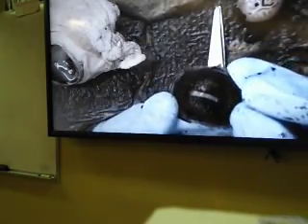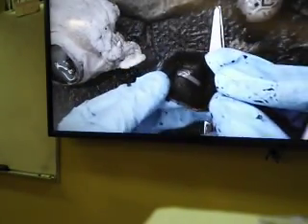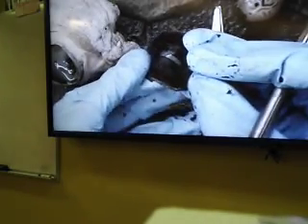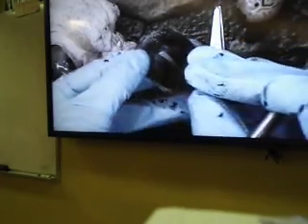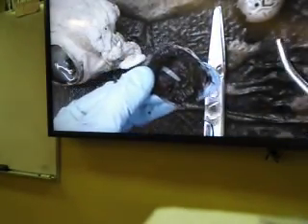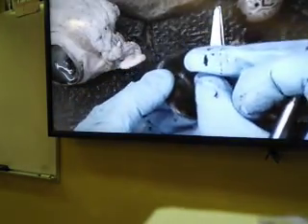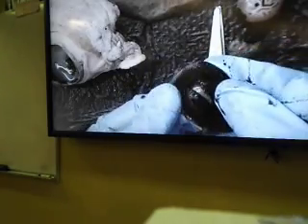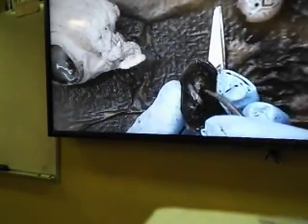Now, iris is smooth muscle, and the front of our iris is colored. So if we have green eye or brown eye or blue eye, that's the front of the iris. Now iris, the smooth muscle, has two types of muscle. One is circular muscle, which when it contracts, will constrict your pupil when the light is very bright, and there is also radial muscle which when it contracts, will dilate your pupil in the dim light. One thing you notice, iris and ciliary body, both of those look black.